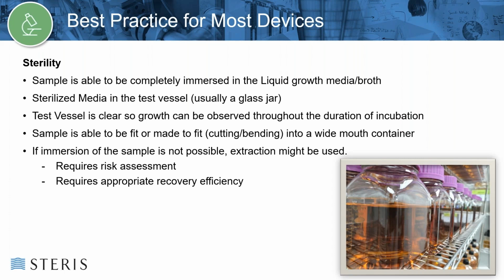The sample is able to fit, or be made to fit by either cutting or bending the sample, to place it into the wide mouth container. If immersion of the sample is not possible, extraction might be used. And again, this requires risk assessment and an appropriate recovery efficiency.